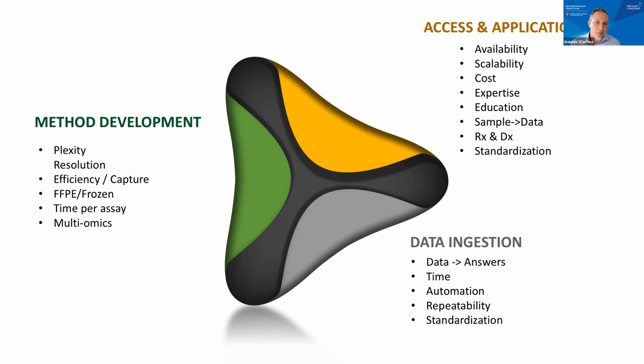But there are three quite prominent challenges. Method development is definitely the obvious one. There are many ways we can improve, but I feel that this is coming. It's the only part that I'm 100% certain improves, and we see this almost every week, that there is a big advancement. The resolution will come, the plexity will come, all of these will come. Then there is access to these technologies. Not just that there is an instrument that will use it, but access that can scale, that can really be embedded in everything we do, as RNA-seq, for instance, is now. That is a different problem to be solved.